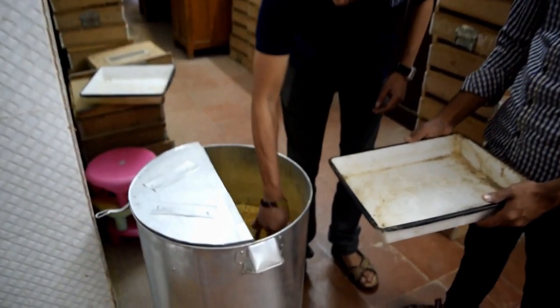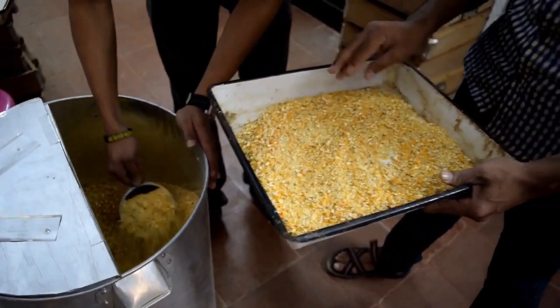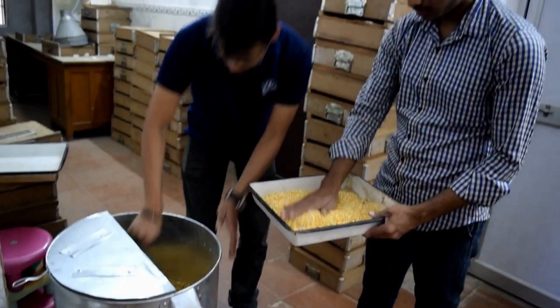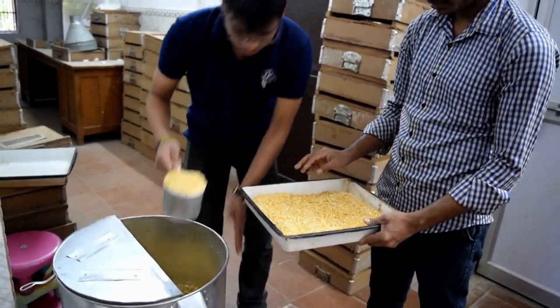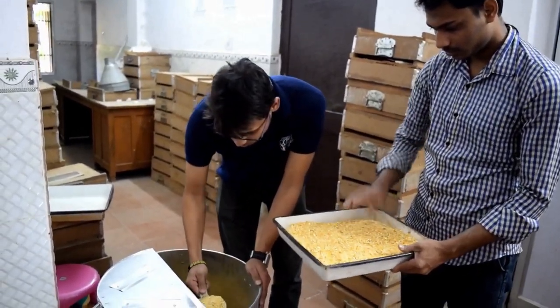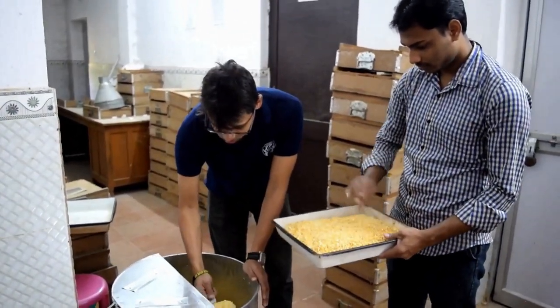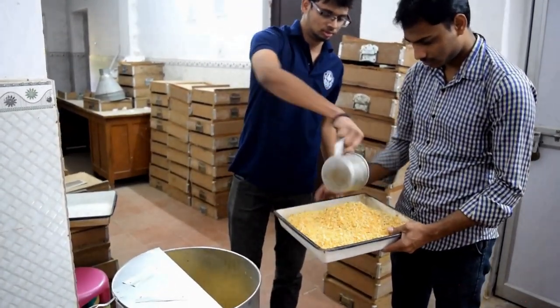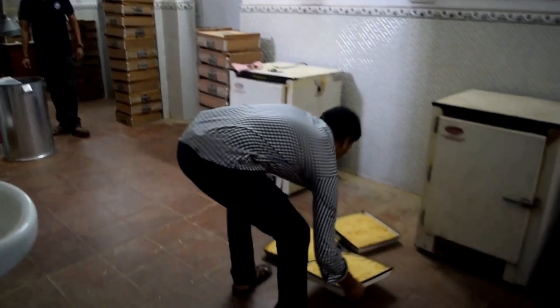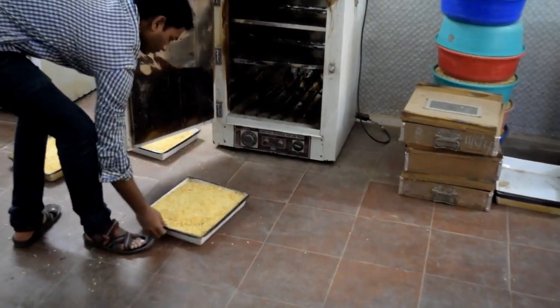Maize grains are taken in metal trays. The trays are placed in hot air oven at 100 degrees Celsius for 30 minutes to kill different store grain pests present in it.